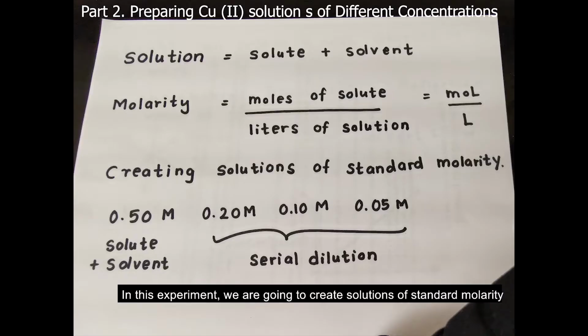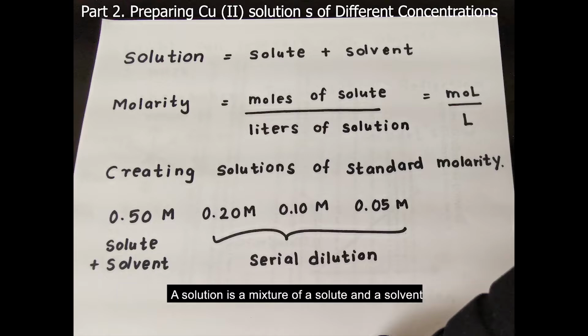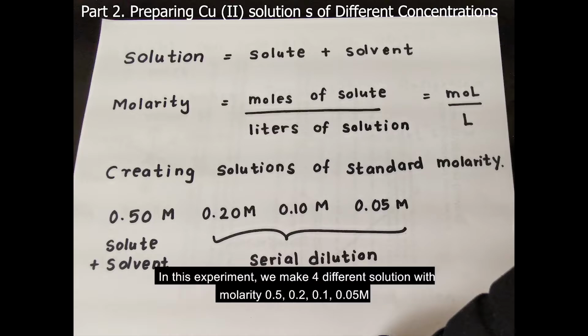In this experiment, we are going to create solutions of standard molarity. A solution is the mixture of a solute and a solvent. We can make solutions of different concentrations. In this experiment, we make 4 different solutions with molarities 0.5, 0.2, 0.1, 0.05.